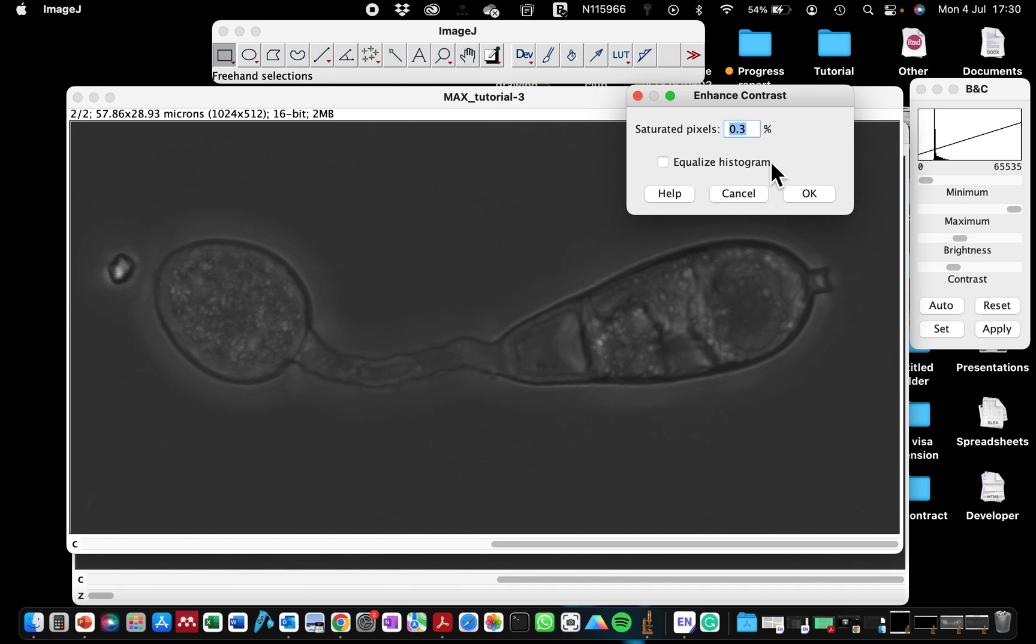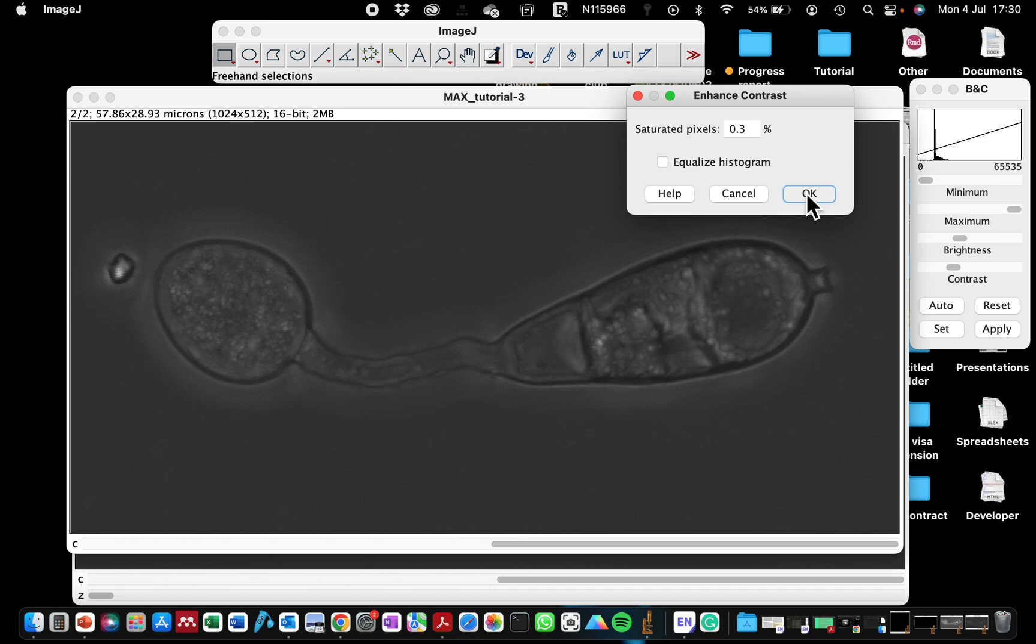So if it's not showing anything here, you can decide to play with different parameters until you get one that is suitable for your image. That's when you should click okay. And after that, remember to save that setting.